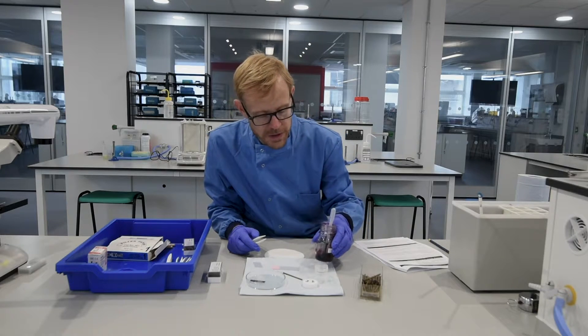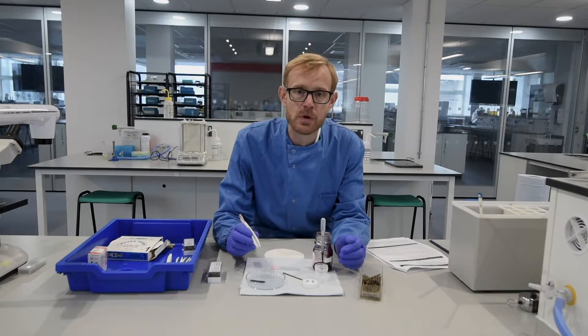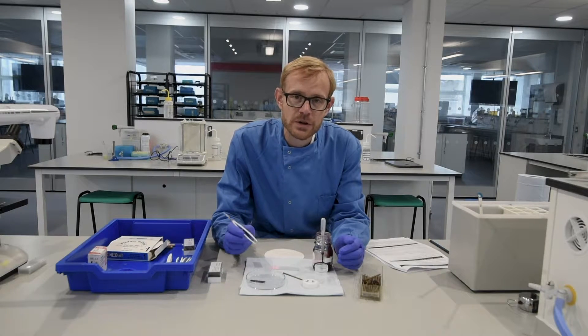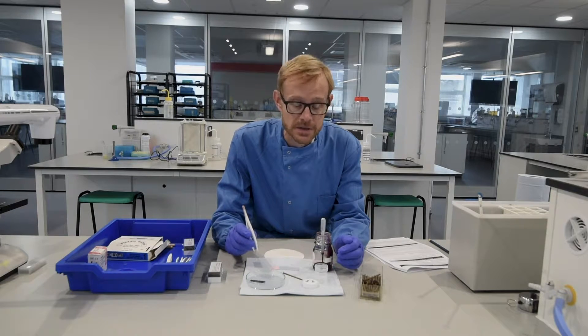What we're going to do is show you how to do an onion root tip chromosome preparation, which is quite a simple technique and should take about two or three minutes. Please make sure you've had a look at the other video taking you through the science relating to mitosis in addition to looking at this video here.